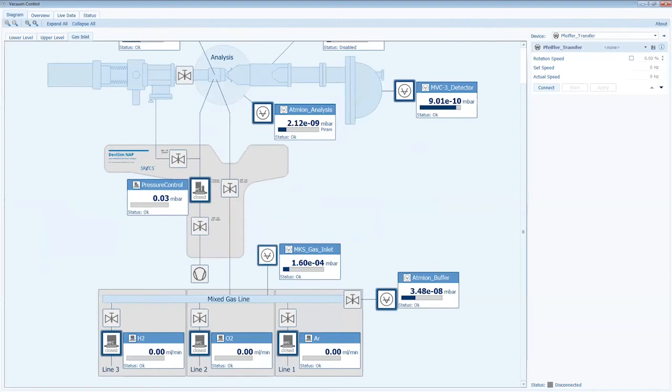So for the gas inlet, I mentioned in my talk that you have a mixed gas line. You can connect any kind of gas to here. Those flow controllers are actually preset for certain gases: hydrogen, oxygen, and argon. So if you want to precisely know if you are using a different gas, like CO or CO2 or whatever, you have to recalculate using some constant. But mostly we are following just the pressure inside the chamber.